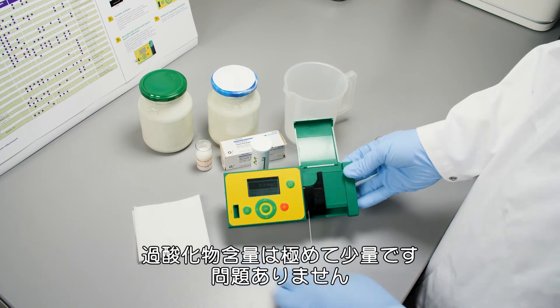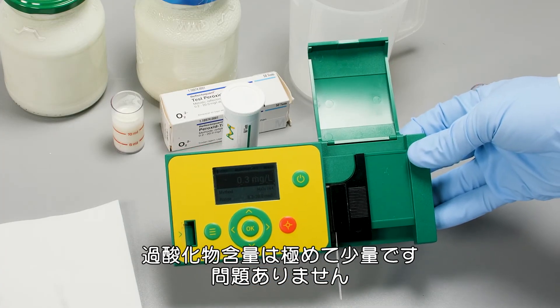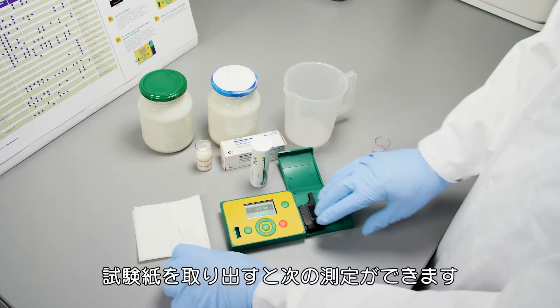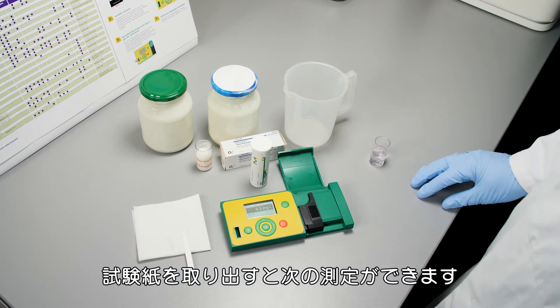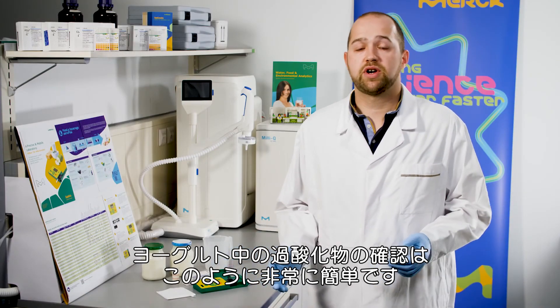As you can see, we have a very low content of peroxide in our yogurt — all is fine. Then you can remove the test strip and you're ready for the next sample.